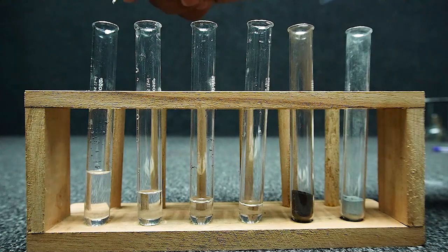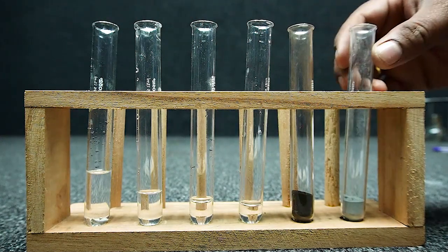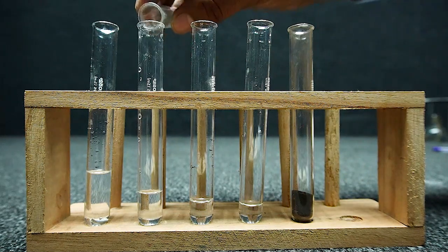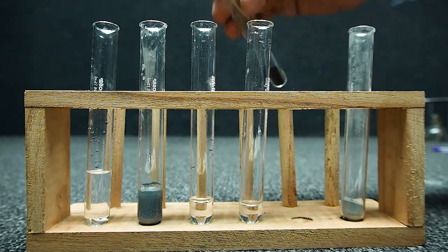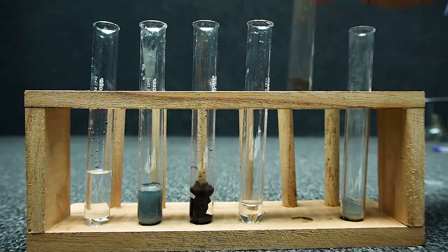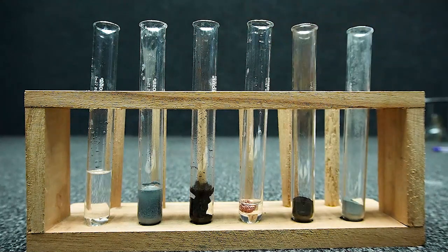Reaction of aluminium with aluminium sulfate. Reaction of zinc with aluminium sulfate. Reaction of iron with aluminium sulfate. Reaction of copper with aluminium sulfate.